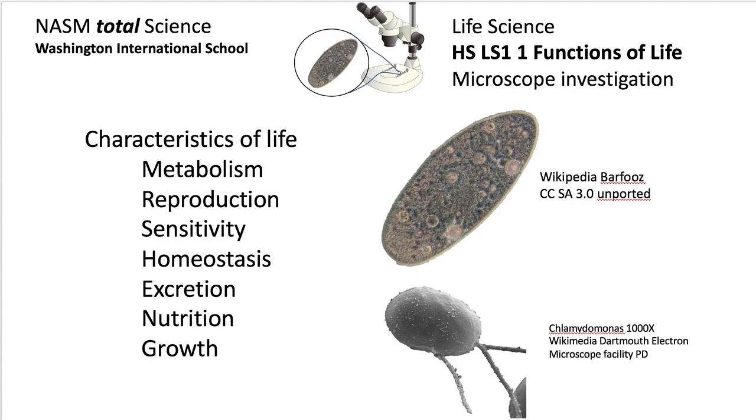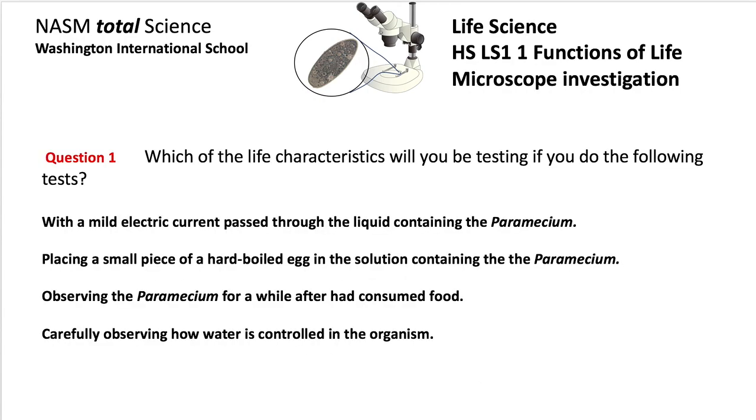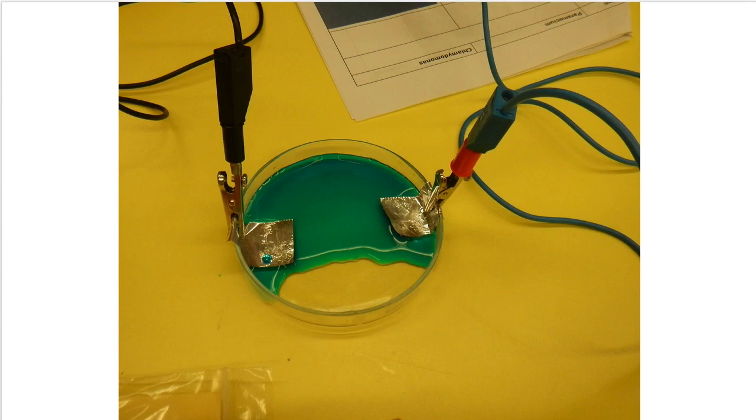Here's a short list, and then you can pause to read a little bit more detail here for each of the functions that the organism will undergo. And which of the life characteristics we'll be testing with the experiments that we're going to look at. Pause and think about it for a while.